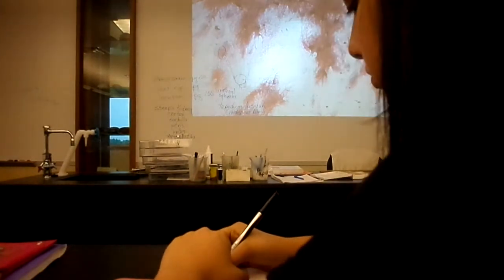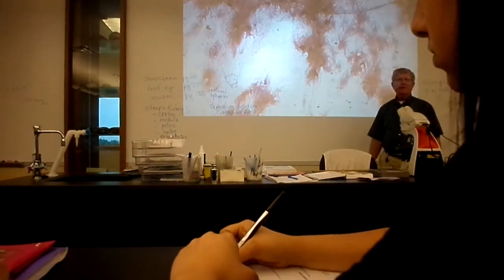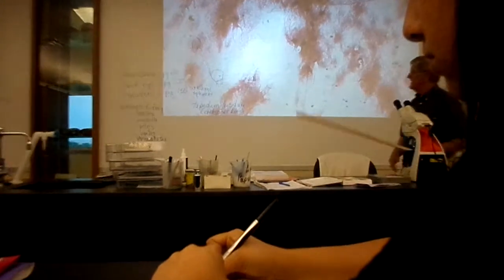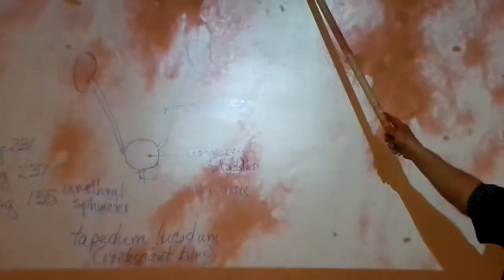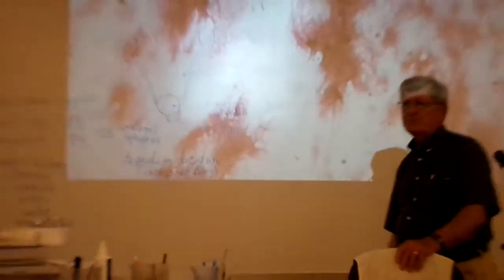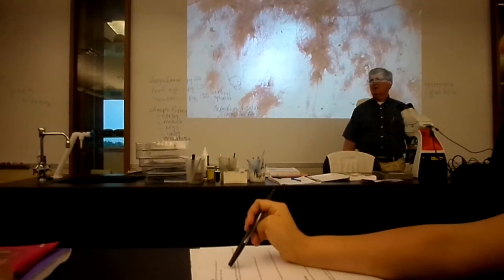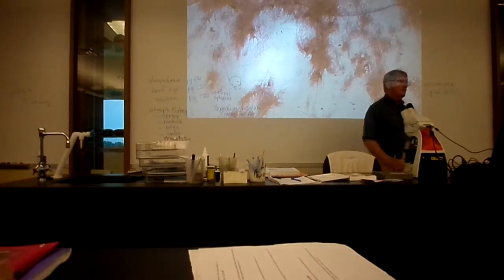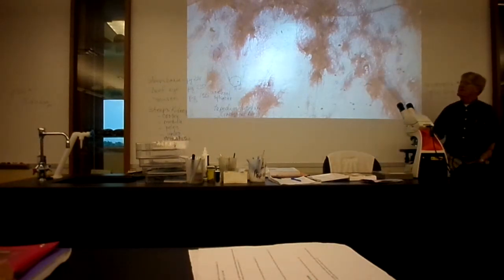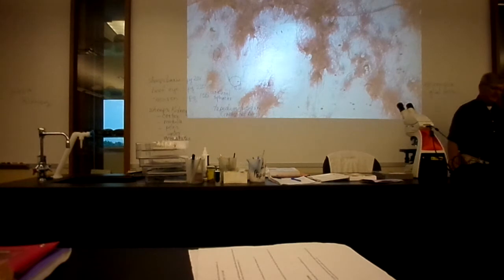For example, all of these big red areas that are kind of diffuse, that's that neuroglia. And in this image that I'm projecting now, all of these dark objects, and I know they're not in sharp focus, and yours are, these are the neurons. So the neurons are not occupying the entire tissue. When you looked at epithelial tissue previously, everything you saw was epithelial cells. But now when we look at the nerve tissue, the nerve cells are very sparse compared to the neuroglial cells.